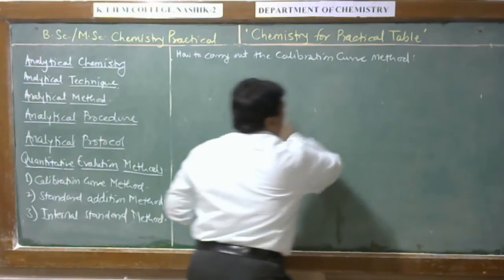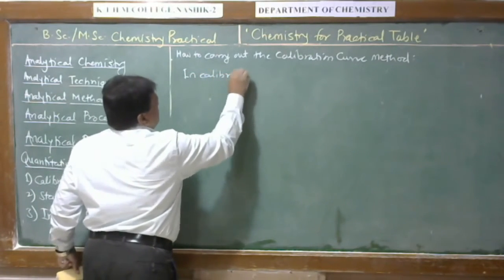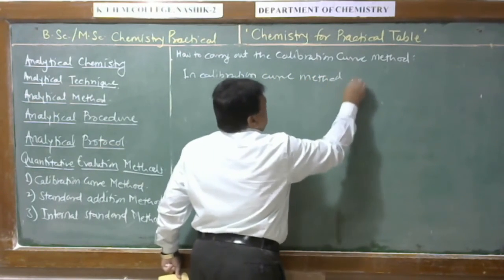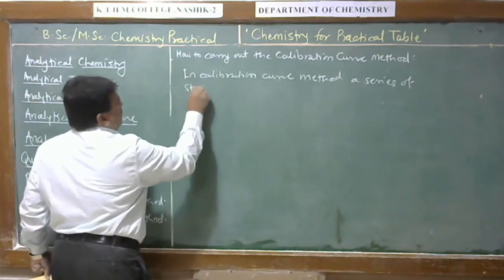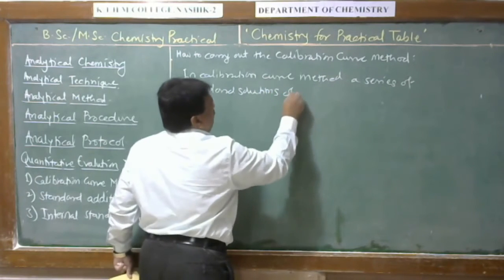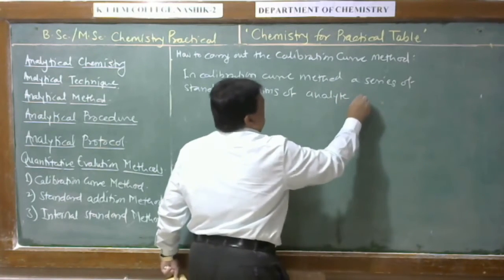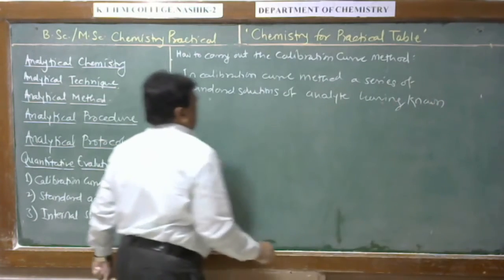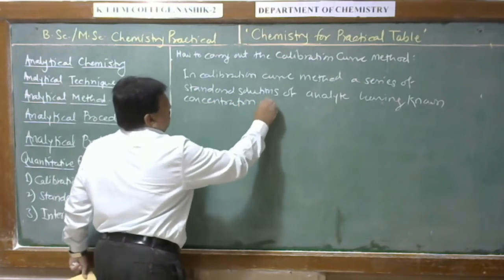Now we discuss how to carry out this calibration curve method in the laboratory. In order to carry out the calibration curve method, a series of standard solutions of analyte having known concentration are prepared.